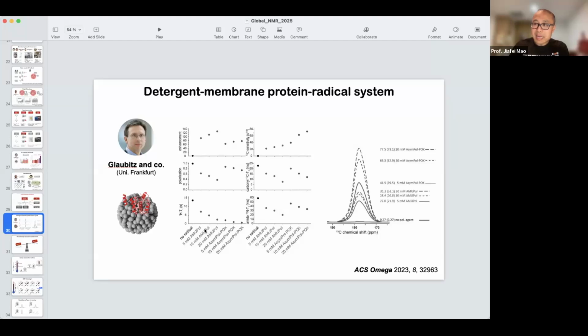Another thing I can tell is on a homogeneous system, don't go below 30% glycerol. Because if you go below 30%, you will have phase separation, and the ice formation will push out the rotor cap.